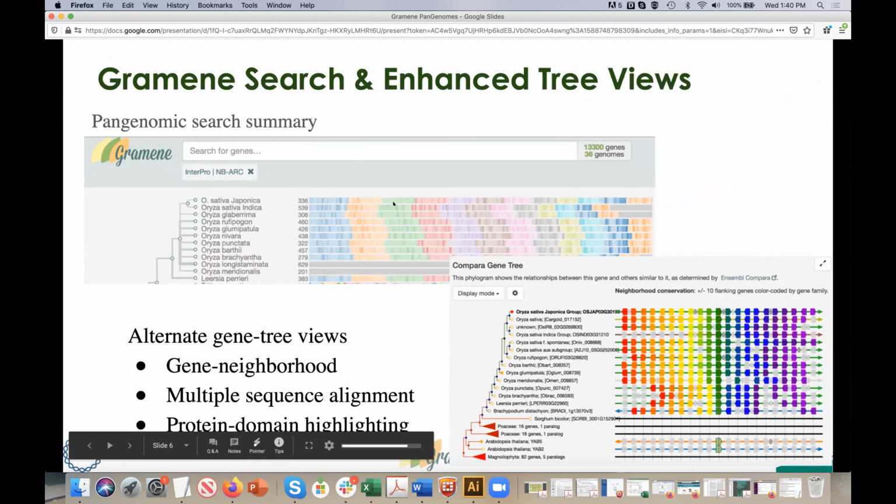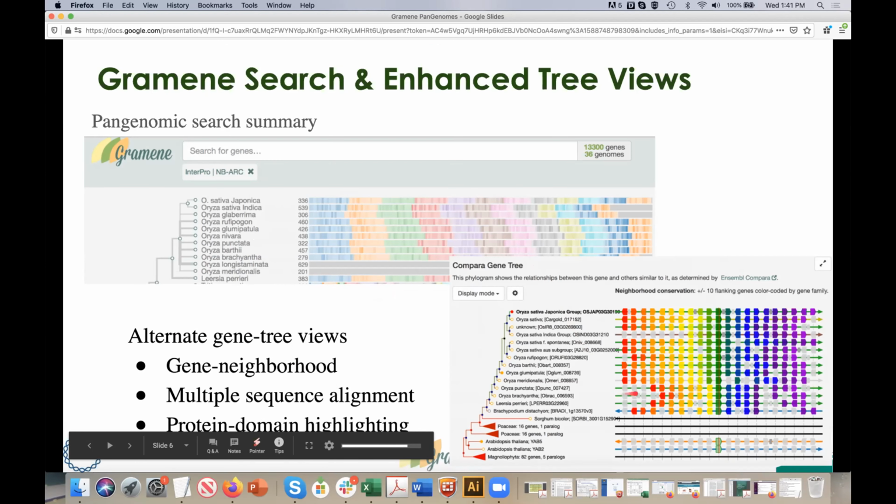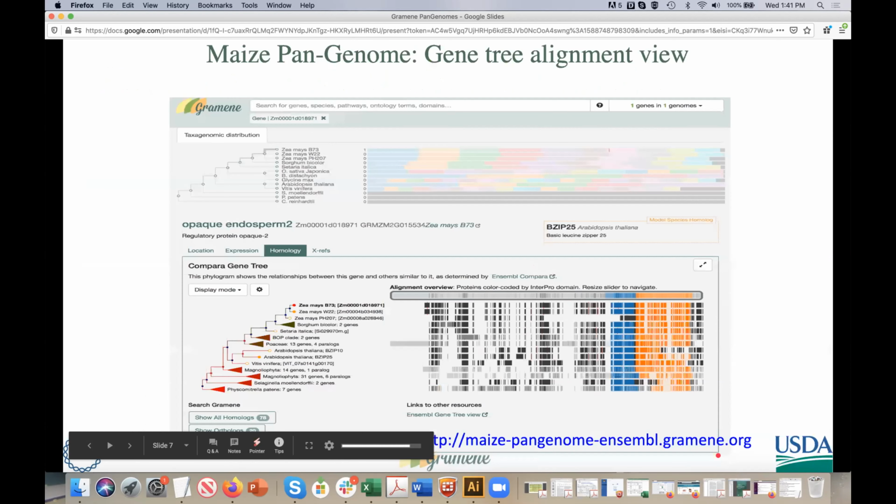And you can go into single genes in this example. Let me use the pointer. You would have the gene-centric view, here with the red line, and then you can have flanking genes to both ends and see how the conservation works in a whole clade or in a whole group of genes.